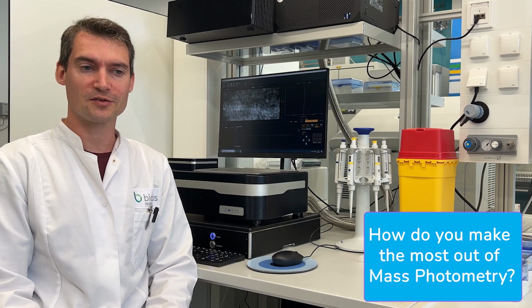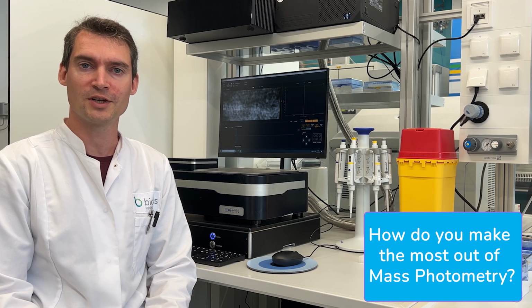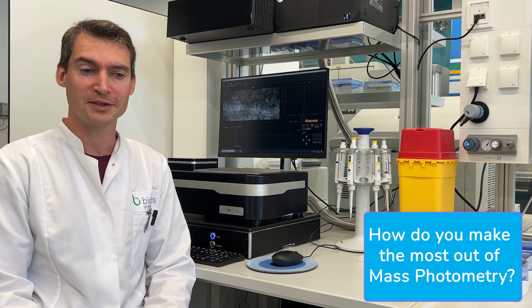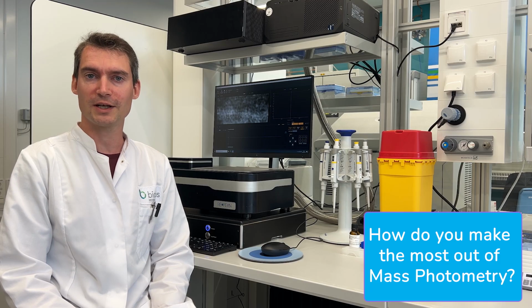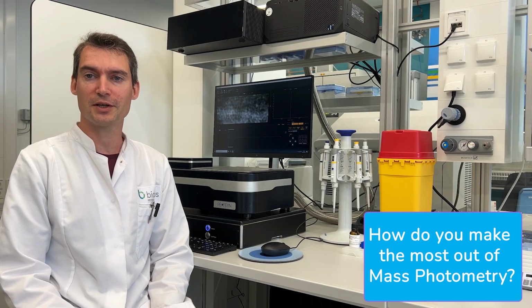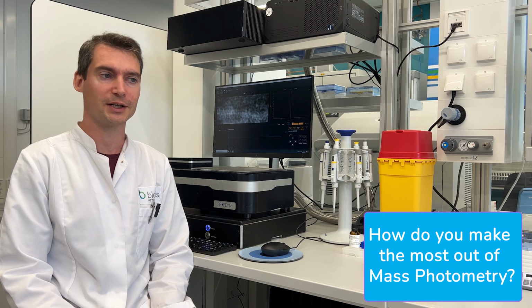The second experiment is more complex. Here we want to form a protein complex of 2 or more components, which we first have to put together and then purify via size exclusion chromatography. In this attempt, it is very handy to have first an initial checkup of the single components, and then after the run be able to again quickly determine the composition of the complex peak that we just purified. It is just another layer of safety that is very quick to apply immediately before we go into the final methods of determining the structure.